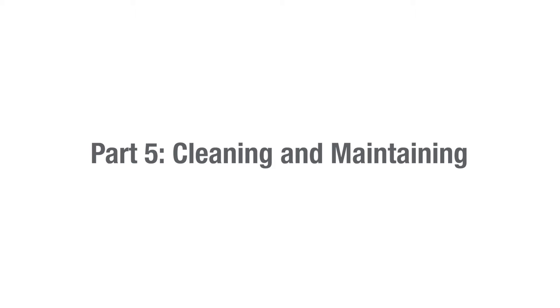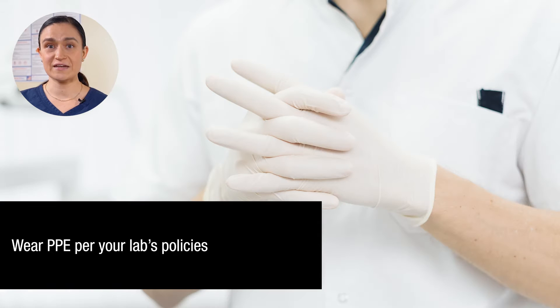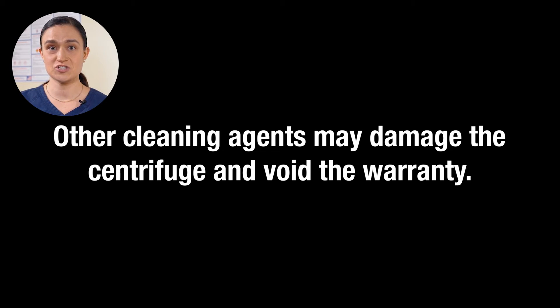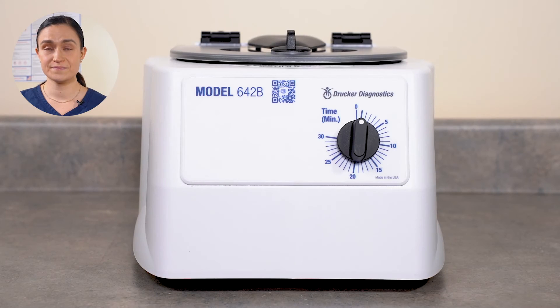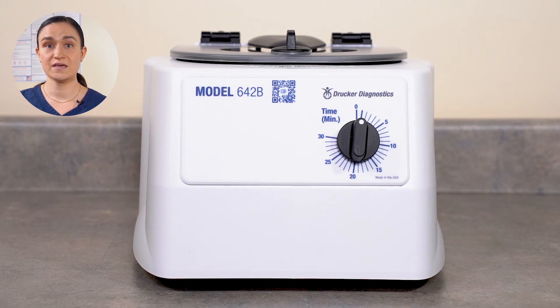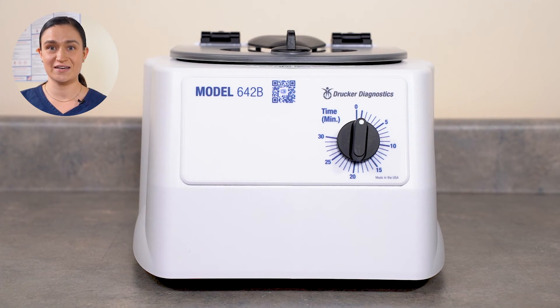Part 5: Cleaning and maintaining your 642B. Your 642B requires no regular maintenance. Cleaning is easy too. Start by unplugging your 642B from the wall. Make sure to wear appropriate PPE in accordance with your lab's policies. Use isopropyl alcohol or 10% (5,500 ppm) bleach solution to clean. Only the approved isopropyl alcohol or 10% bleach solution should be used — any other substance is not approved and may cause damage to your centrifuge and void the warranty. Apply your isopropyl alcohol or 10% bleach solution with a cloth. Do not submerge the centrifuge in water. If necessary, the rotor may be removed for easier cleaning. Links to our videos on how to remove and reinstall the rotor are popping up on your screen now.